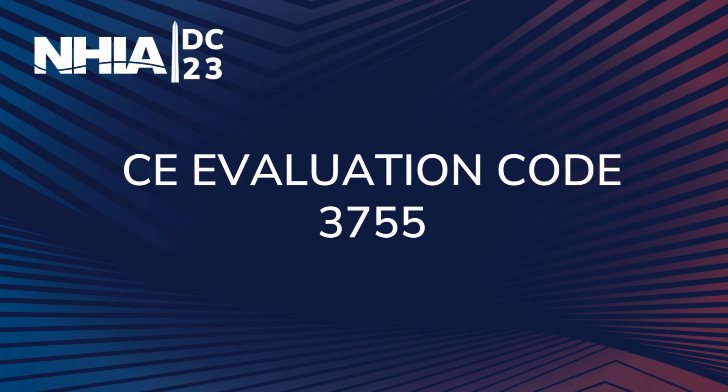One of the things too with cleaning and not being able to visibly see some things, I know people that will chalk an area in the ceiling of the clean room with a really light colored yellow chalk or something and make sure that it got cleaned. And they'll go back in and spot check that. That trick only works once, but if you have concerns or issues with that, that's something that you can do.